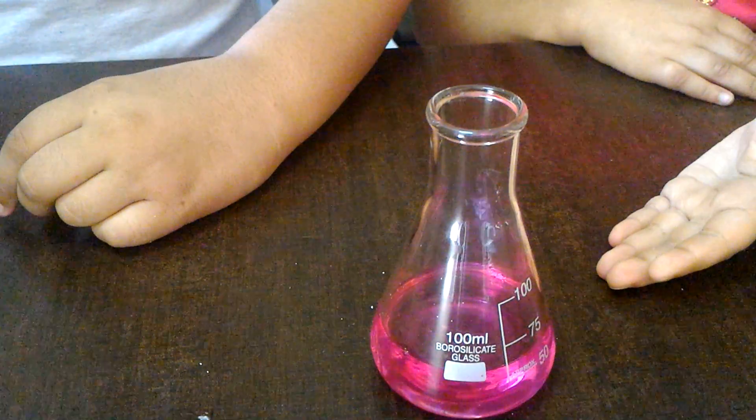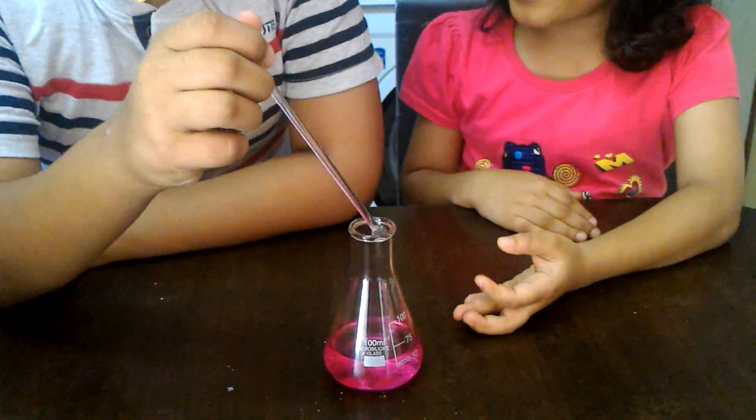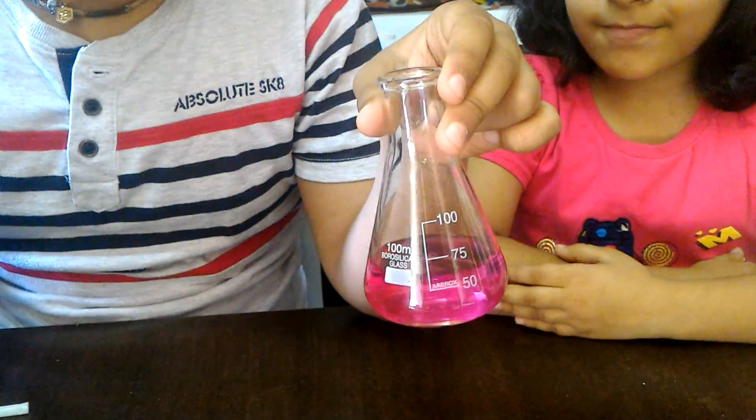It's pink! Yeah, it turned into pink color.